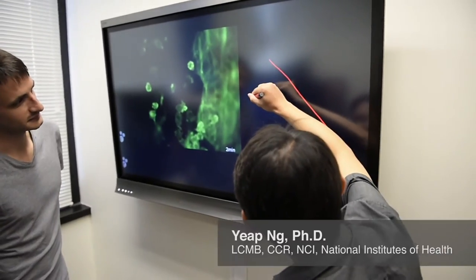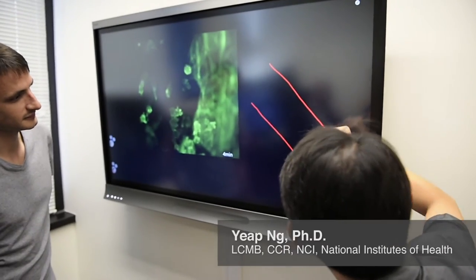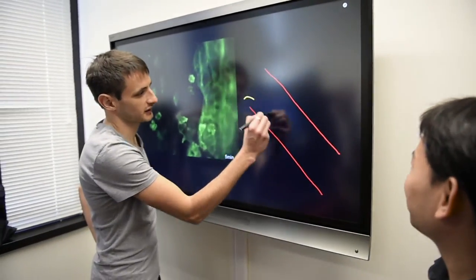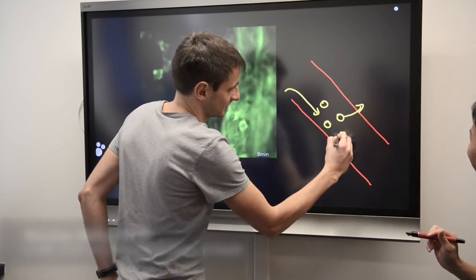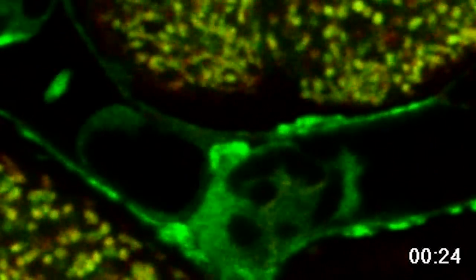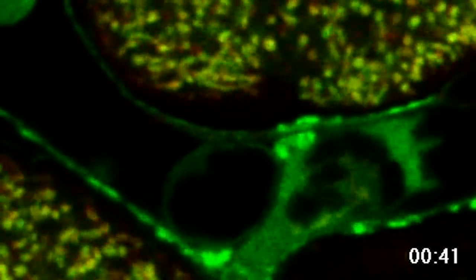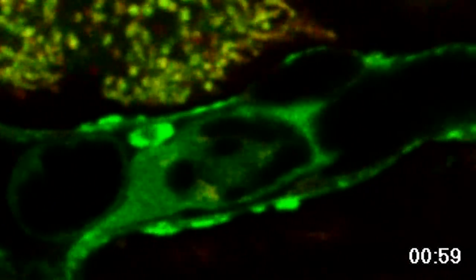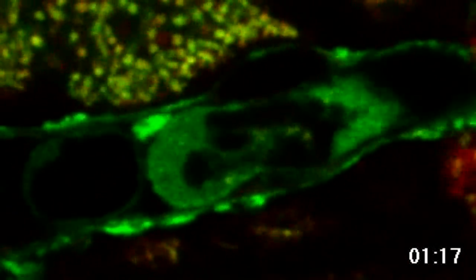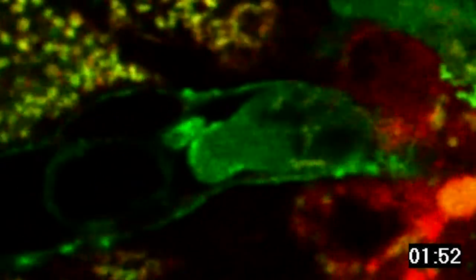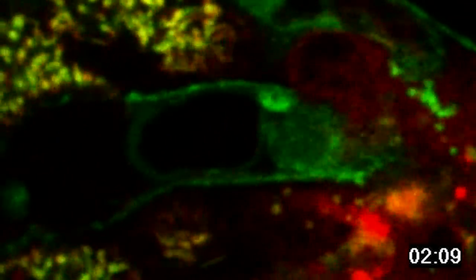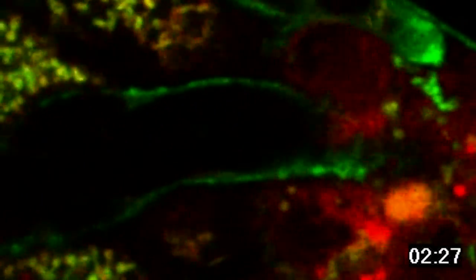Is this contractile machinery also used in other physiological or pathological processes? We are beginning to investigate this question. For example, during cell motility. This is an immune cell that is moving inside a blood vessel in breast tissue. The green fluorescent is again myosin-2 that is recruited in different areas of the plasma membrane to drive this complex motion through contractions.